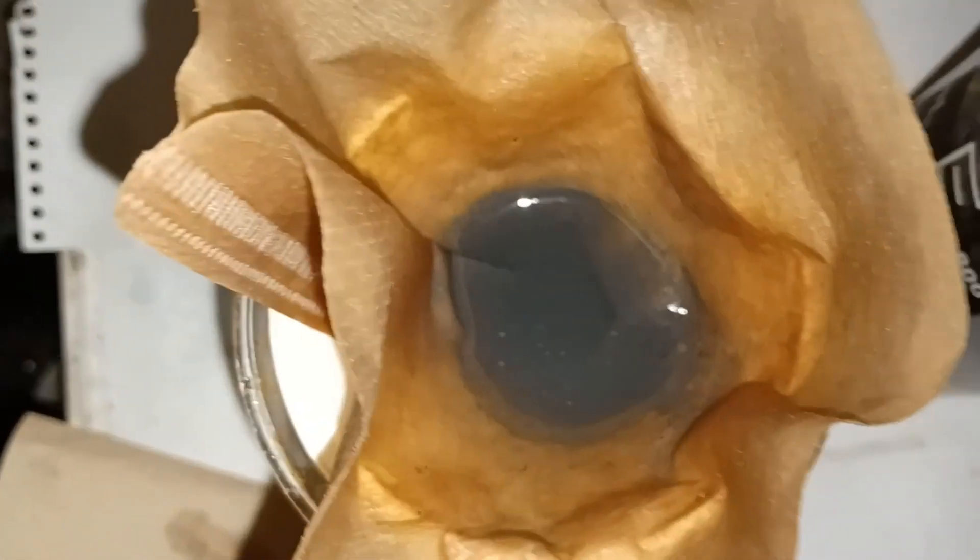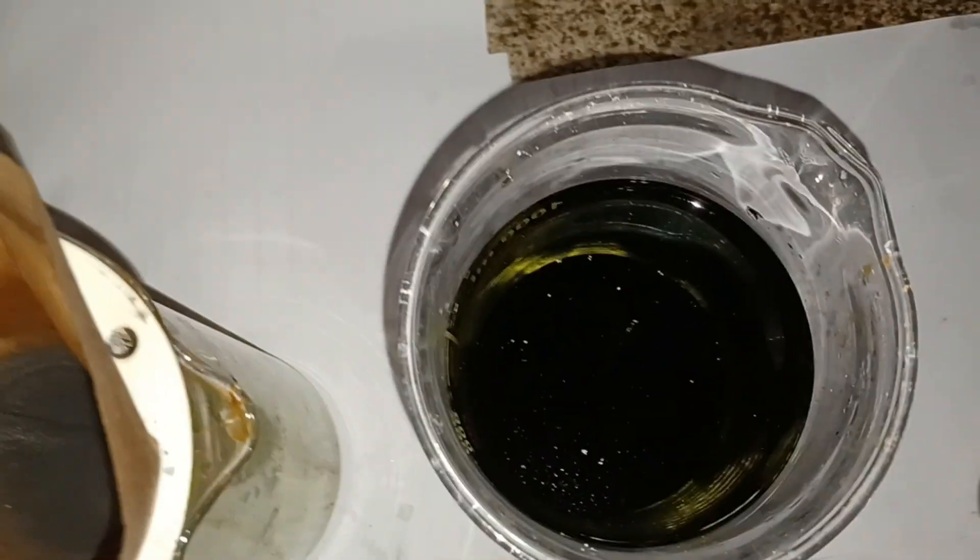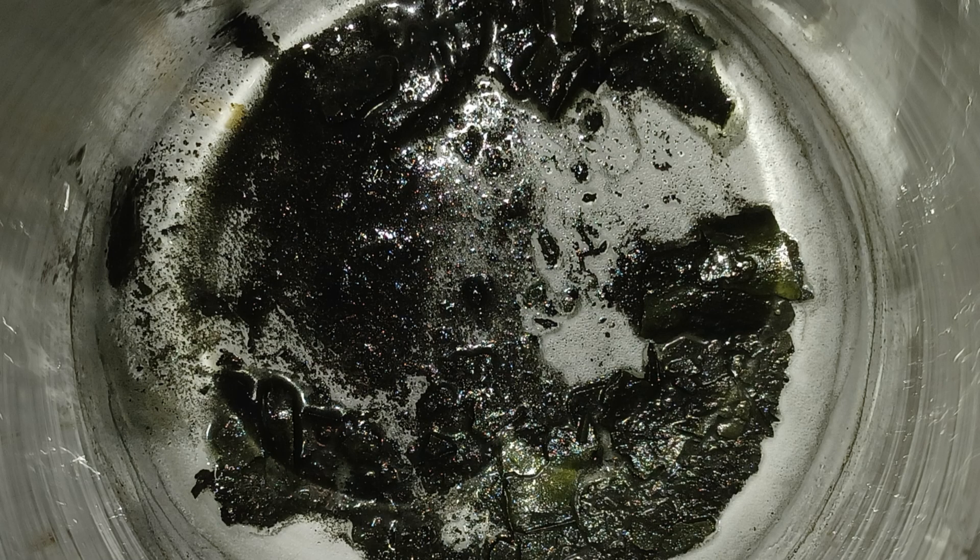No doubt, there was still some palladium left in the solution, and I lost some with washing, but worry not, I'll get it soon. Dried palladium didn't look the best, so I boiled it in distilled water.